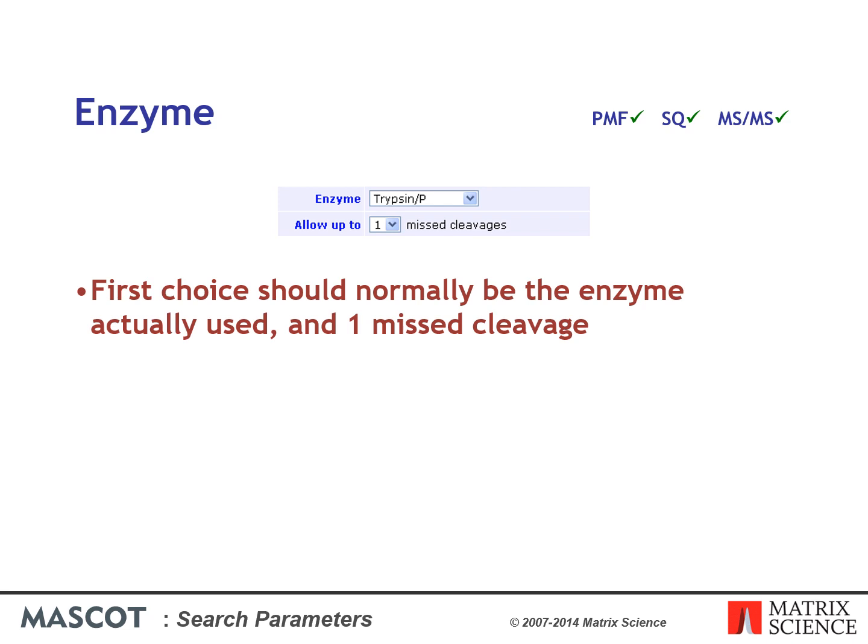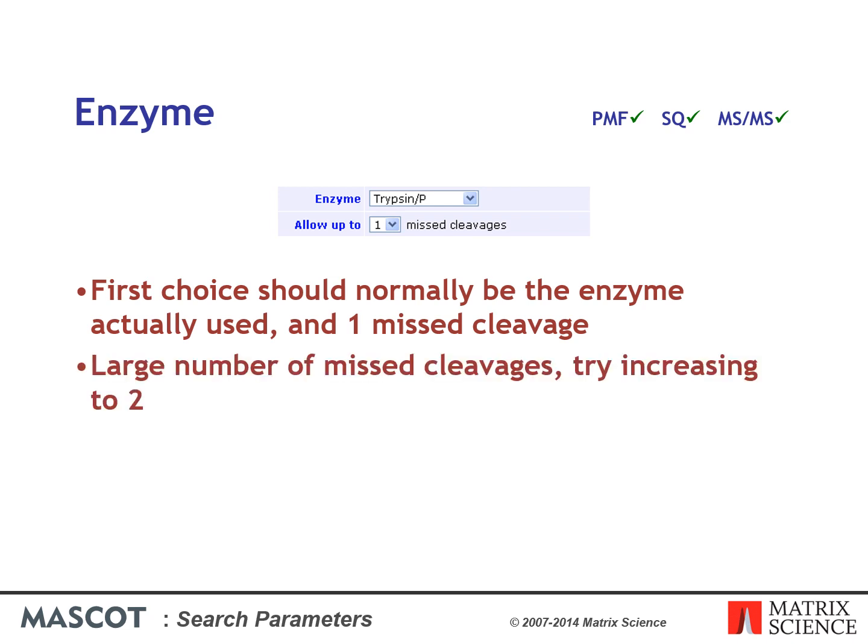If experience shows that your digest mixtures usually include some partials, that is peptides with miscleavage sites, you should choose a setting of 1 or maybe 2 miscleavage sites. Don't specify a higher number without good reason, because each additional level of miscleavages increases the number of calculated peptide masses to be matched against the experimental data. In other words, the miscleavage parameter should be set by looking at some successful search results to see how complete your digests really are.